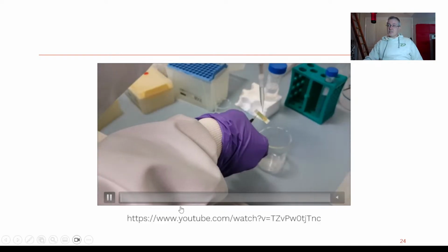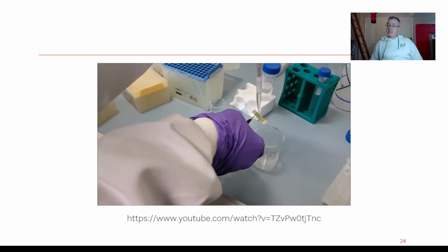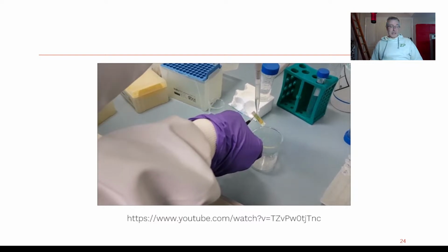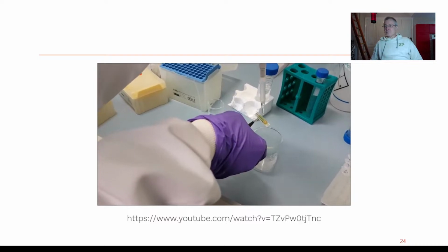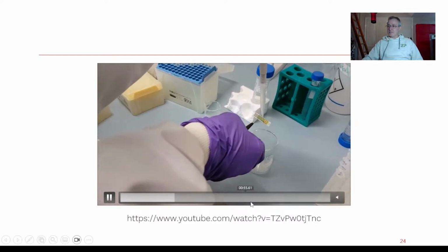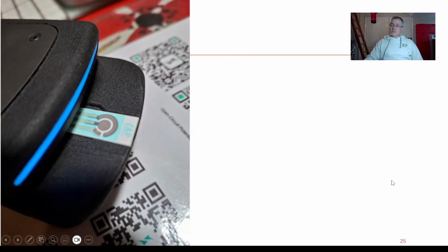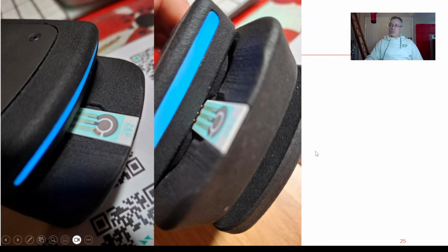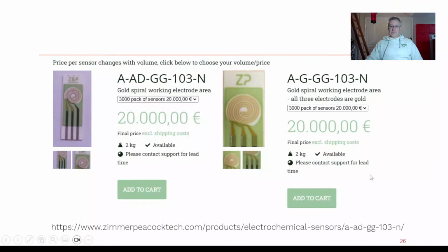If anyone's interested, there's a long time video up on YouTube actually where we show us testing some of our screen printed electrodes in organic solvents. Once upon a time, we used to promote these electrodes quite heavily, but they've got more and more expensive over the years as things like the gold has got more expensive. So we don't promote them so much these days, but we do have these things. So this old video might be useful if you haven't already seen it. And also, if people go forward with these screen printed electrodes, also know that they do work on our potentiostat. And I did make sure that everything fitted by having a little test myself earlier on.